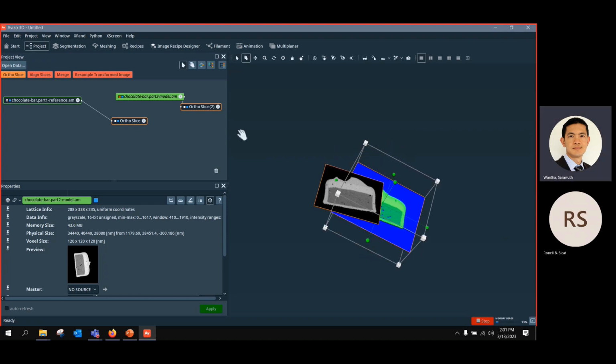And then you align, but I'm not sure if the module align center in registration will do the job, but it's more like stitching the images.